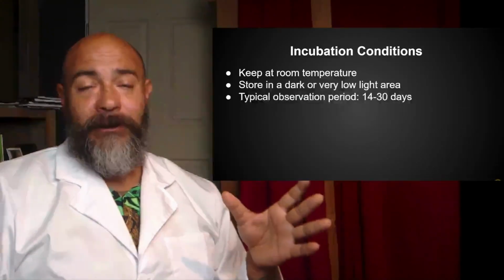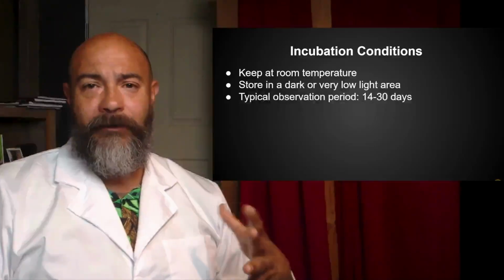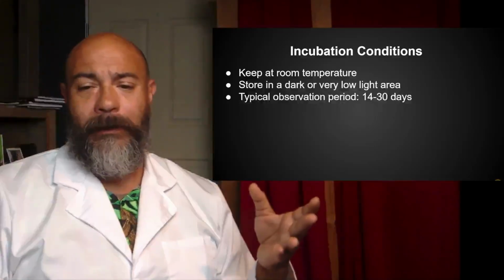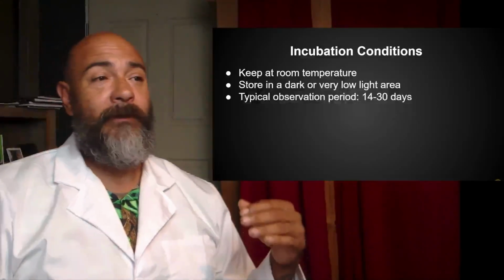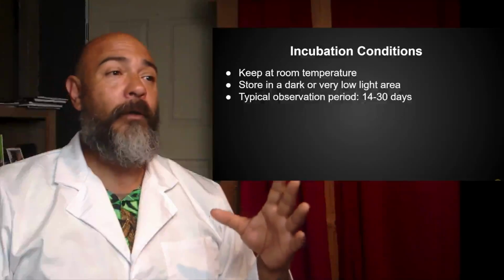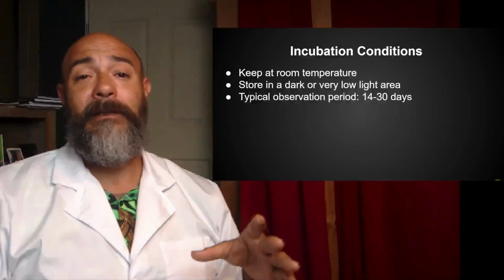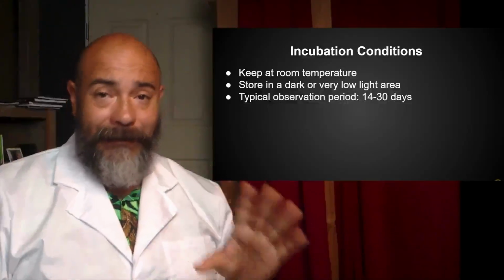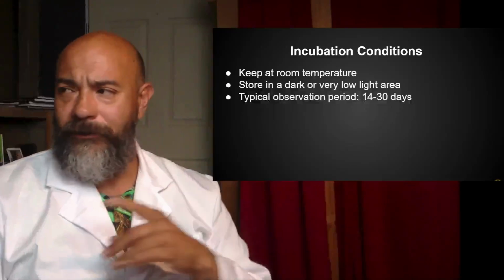The incubation conditions. Now, once you put your explant into culture, you need to incubate it, okay? Because you're not trying to grow a plantlet, you're trying to grow callus formation. Callus formation generally will form and grow much better at room temperatures in a dark or very low light area. That is key. Dark and very low light make a big difference.